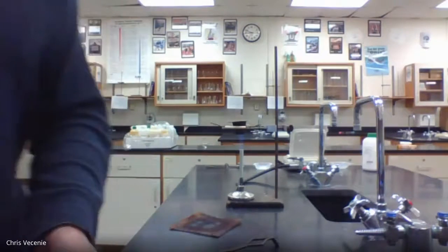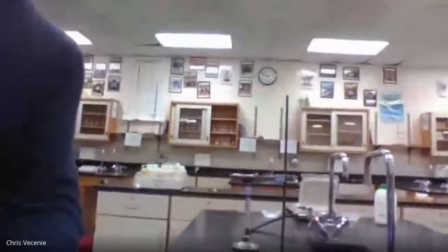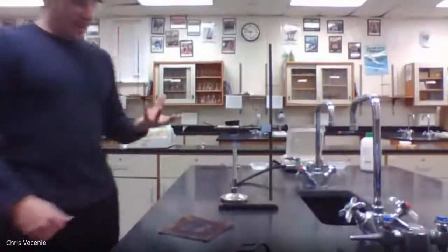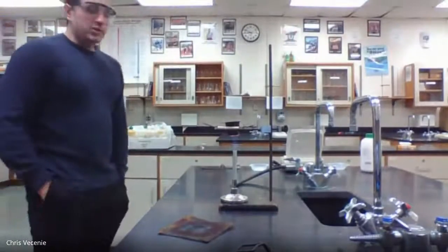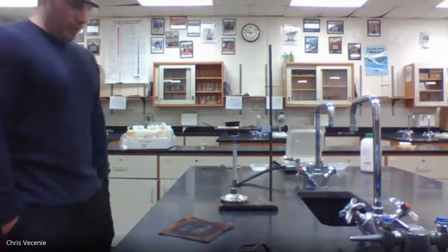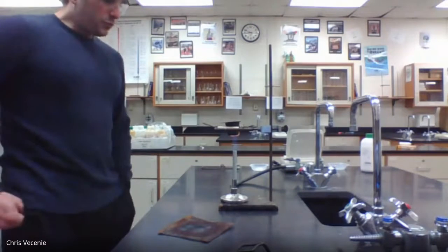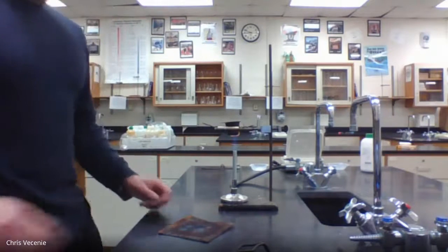And just so you guys can see, notice here with my lid, I'm always leaving a little bit of a crack on the lid so that if there is any substance that's trying to burn away, it has somewhere to go. All right, so we're going to let that heat for 2 minutes. And just like always, right, I've done this ahead of time. So I know it's already pre-cleaned, but we would have let it go for 2 minutes.